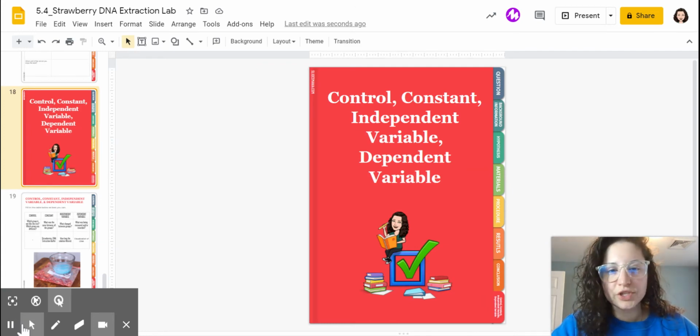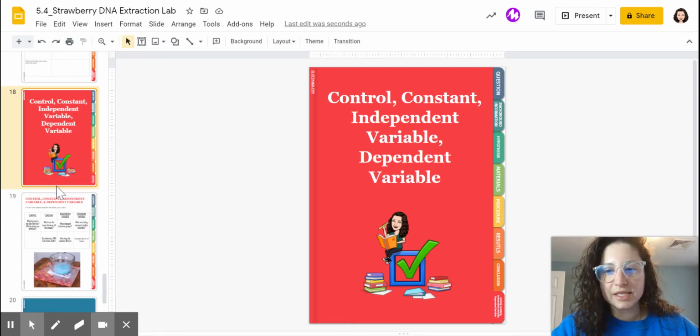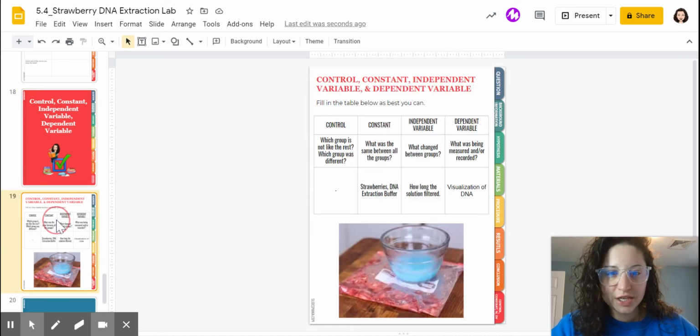We do have one more section to look at really quick. This is the experimental variable section. So this is the control, constant, independent variable, and dependent variable. So for this lab, because it was more of an exploratory type of lab, there was no real control for this lab. We can maybe use a picture of what the DNA is supposed to look like, but it is what it is. As far as a constant goes, we kept the strawberries the same. The DNA extraction buffer was the same. There was some sameness between if we had done this in groups.